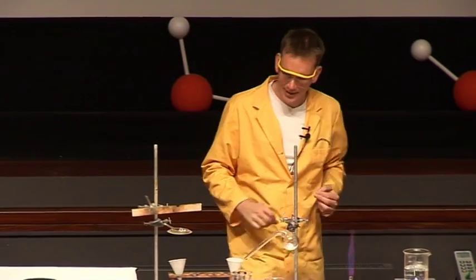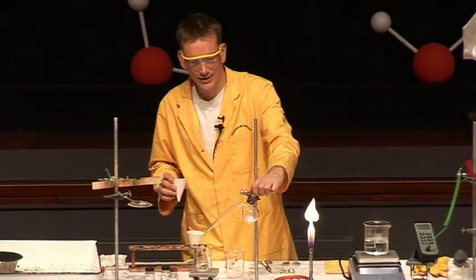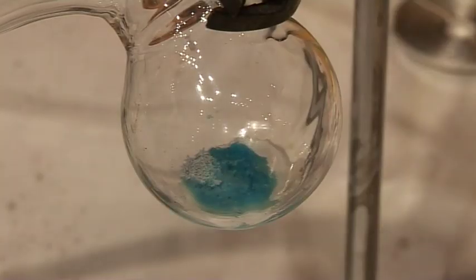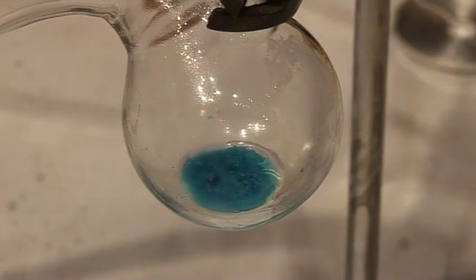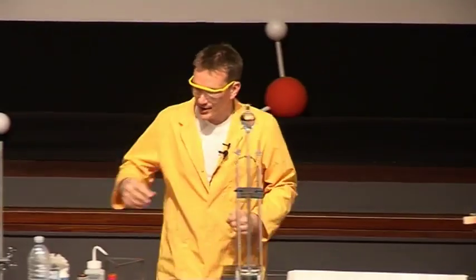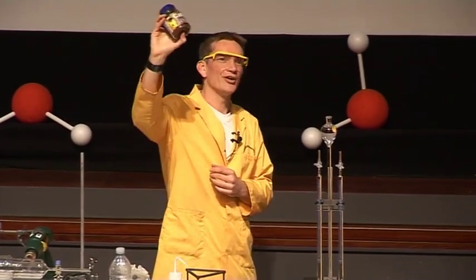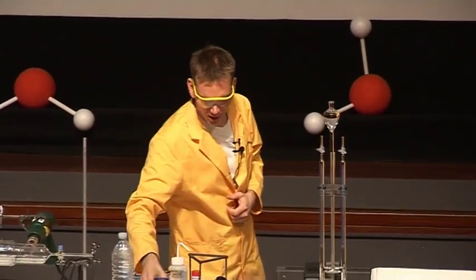What would happen if I add the water back? So, for instance, our copper sulfate here, this white powder that we now have, if I add some water back to this, there's some water, add it back, it goes blue again. And we'd say that the copper sulfate has been rehydrated and it's reformed the blue colour that we see due to the interaction of the copper ions with the water. Well, many things can be rehydrated. Of course, we use this stuff all the time. This is instant coffee. This is dehydrated coffee. We put it into our cup, add some water, rehydrate it, and we get our coffee back.